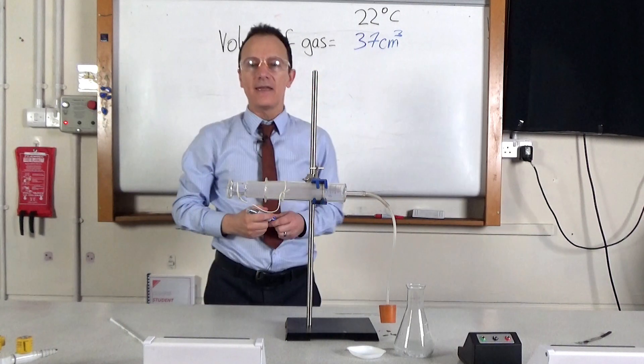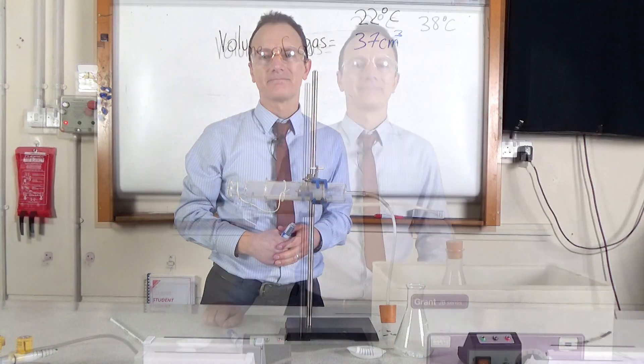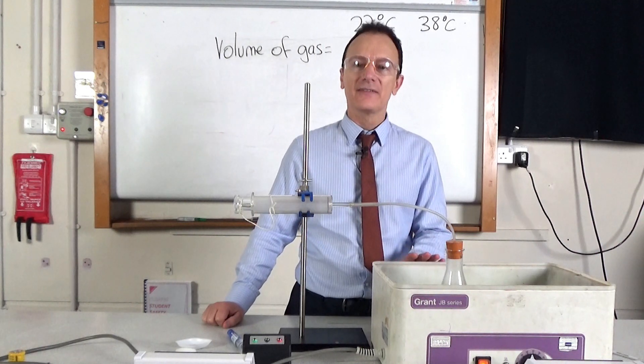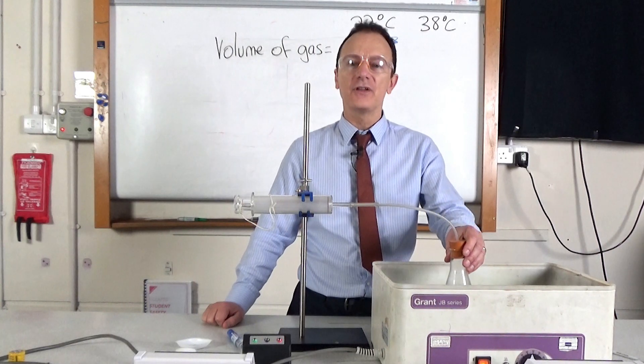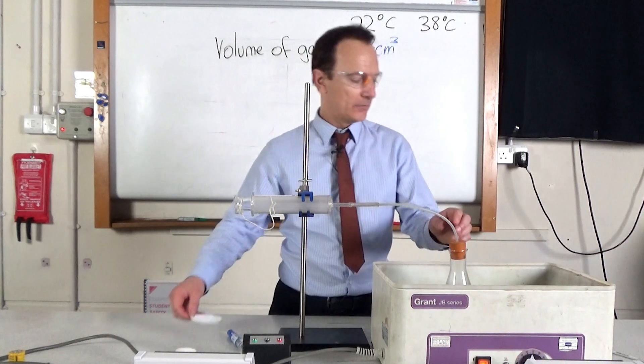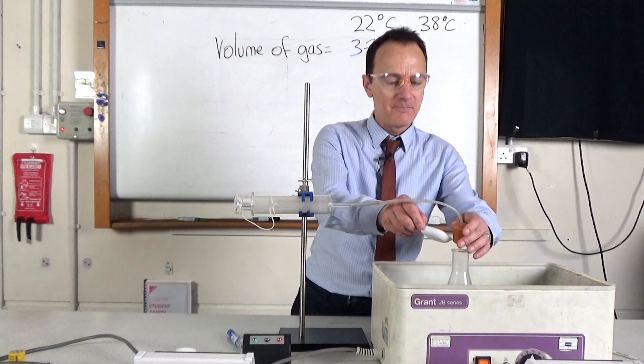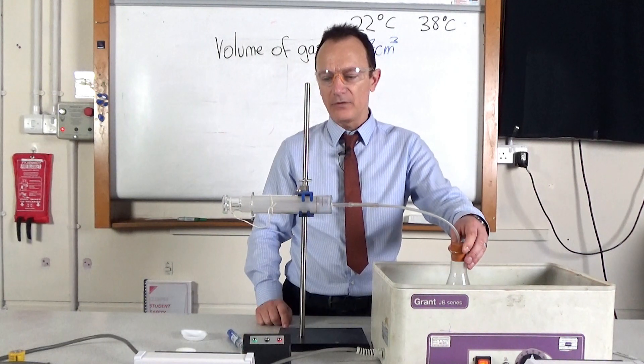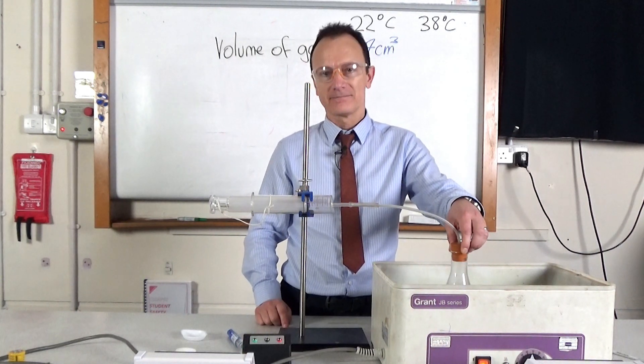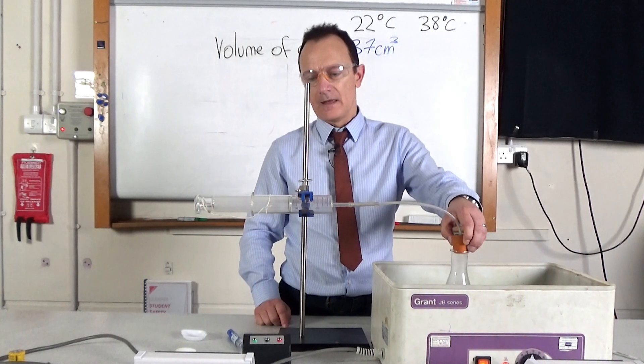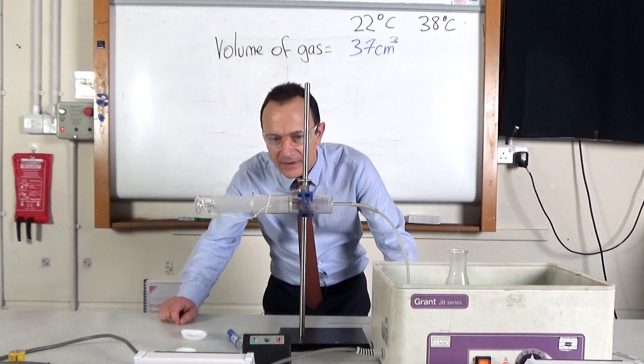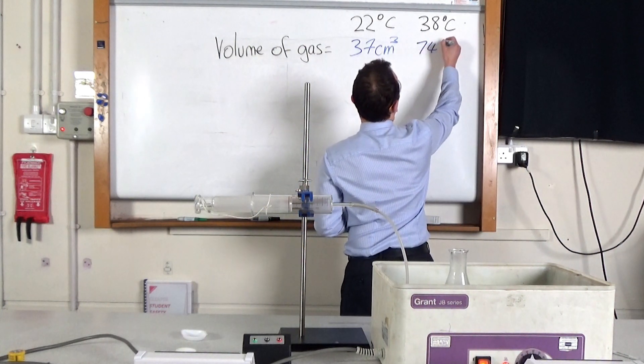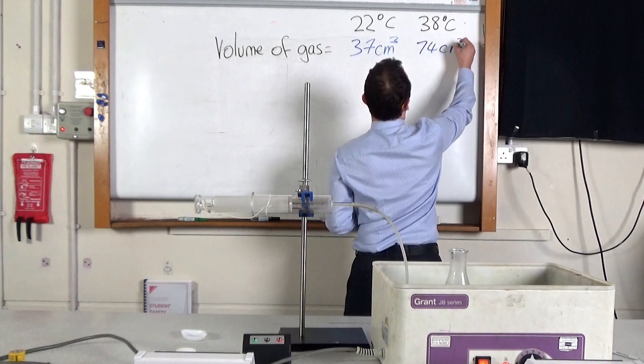I'm now going to repeat it, but add the acid at a higher temperature. I'm going to repeat the reaction, but this time the acid has been in this electric water bath, so it's been heating up to 38 degrees C. So once again, I'm going to add the same mass of magnesium to the acid, start the stopwatch and see how much gas is made in the first 10 seconds. And I can now see that in the first 10 seconds, it's made 74 centimeters cubed of gas.